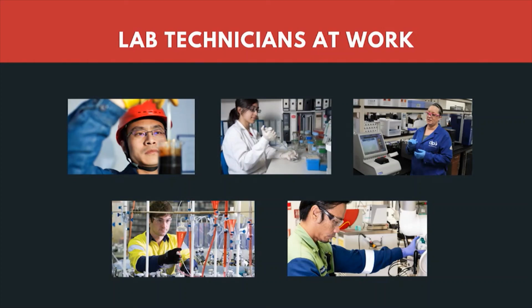Once a sample arrives, the lab supervisor will allocate the samples to the technicians, and the technicians perform the test as defined by the standards, and finally enter the values in the register. These details are continuously conveyed to the process group which is running the refinery. If the laboratory gives a result which is not acceptable, then accordingly the process parameters are adjusted in the process plant.